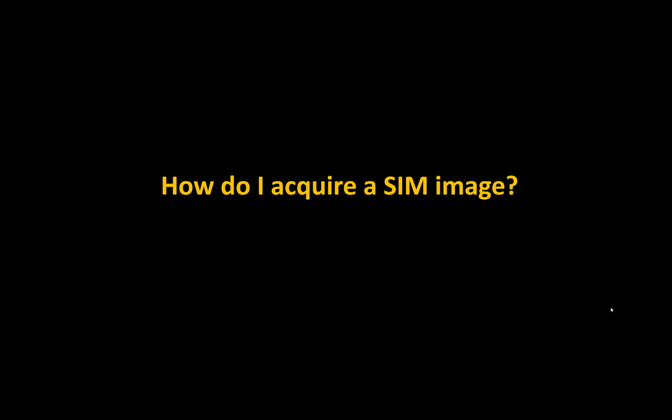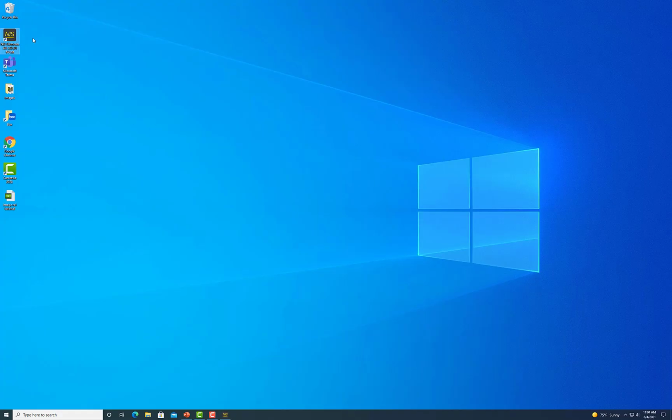So now we're ready to open Elements and acquire a SIM image. What I want to do for the next little bit is just talk about the settings that go into doing this and the approach you ought to take to get a SIM image. So here we are. Now we just want to double click on the NIS Elements software. I've actually already done this and opened Elements because it does take a few minutes to load.